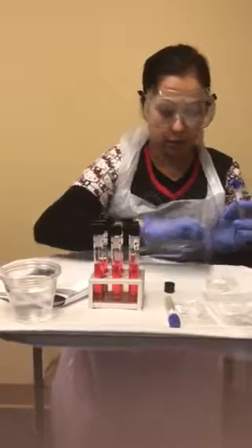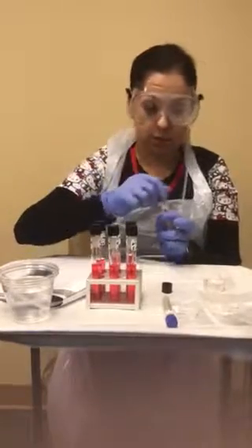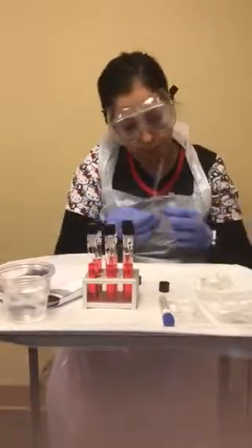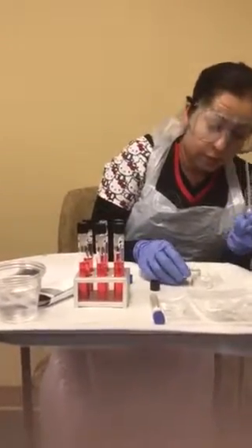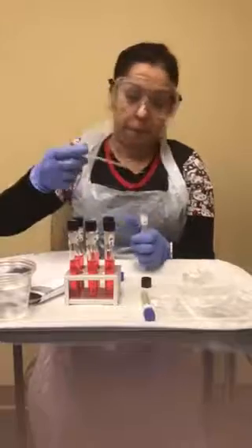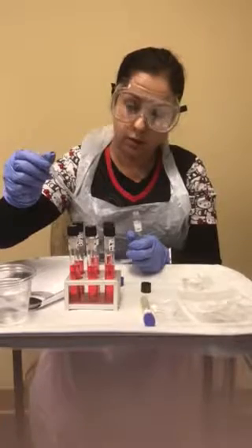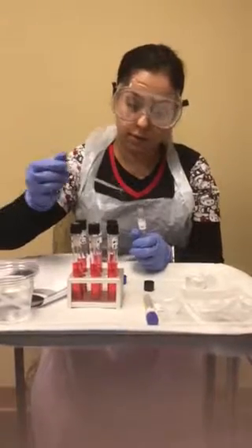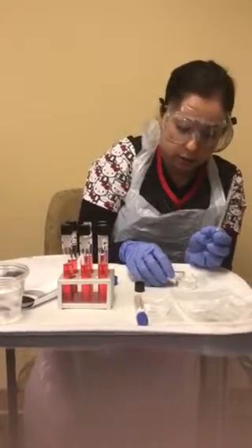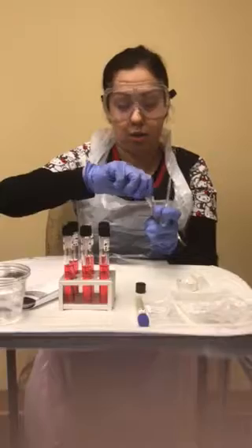I'm going to put my little Durham test tube in and add four drops into my second tube for the fructose. I'm holding the pipette in my hand because I don't want to put it back into the alcohol and contaminate it. One, two, three, four. I think that would be enough for the next one — that way I don't have to keep this broth in my hand.